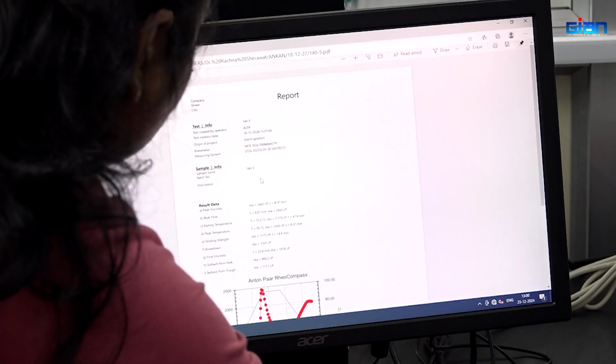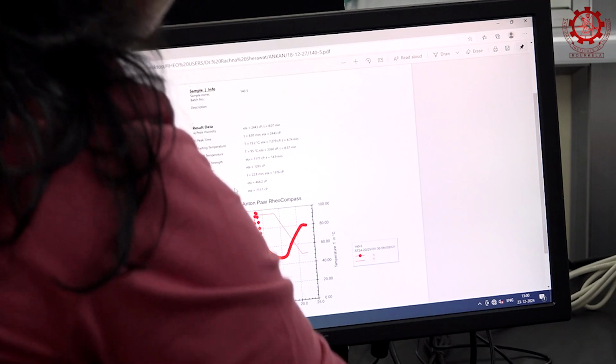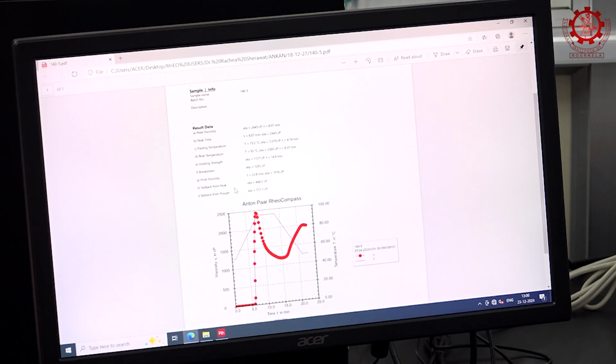The unit of viscosity is only centipoise. Previously we measured viscosity in Pascal second. It will come in mPa·s, I guess. mPa·s becomes the centipoise viscosity unit. For pasting property, we observe viscosity in centipoise, or do we use another unit? If you want, you can convert it.